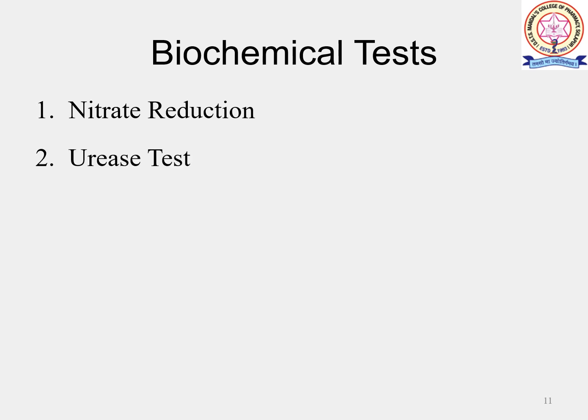Next is the urease test. This test is done by the slope method. The slope is heavily inoculated and incubated at 37 degrees Celsius. It must be examined after 4 hours and after overnight incubation. Here the medium is important, that is Christensen's urease medium, on which the organism is allowed to grow. The test will be negative after 4 hours of incubation and it will be positive overnight.